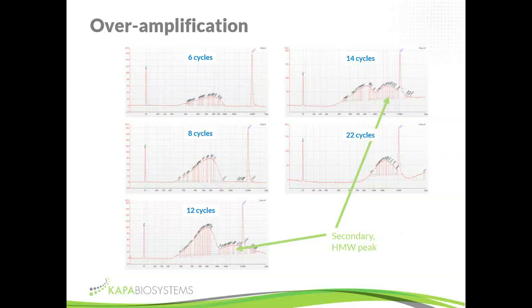And this is almost the bigger consequence, because for every step, whether you're going to cluster amplification or hybridization, it's important to know the actual concentration of your library, especially if you're going to pool, because you want to make sure you're putting the same quantity of each library in that pool for the rest of the process, so it gets an equal amount of probes and an equal amount of sequencing reads.